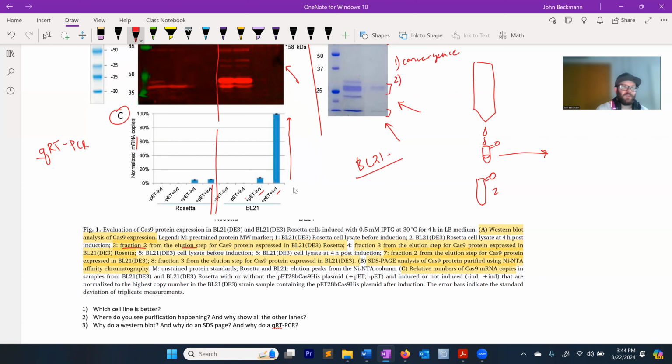So what's actually the conclusion from that? Yes. This clarifies that, again, the problem is not the codon usage, because codon usage would apply a problem at translation. If the codons were the problem, you would have seen a pattern that looked like this.